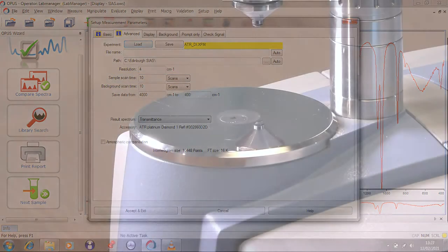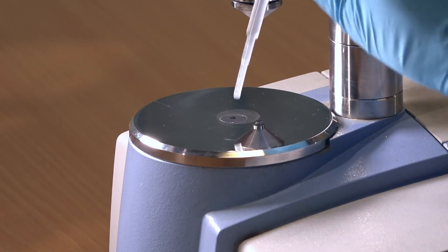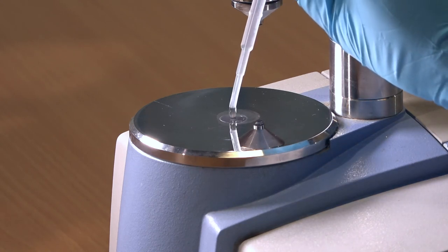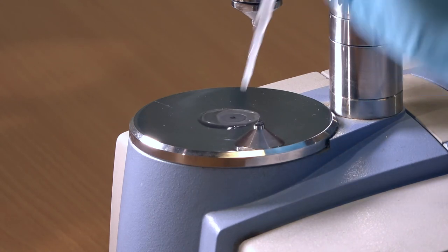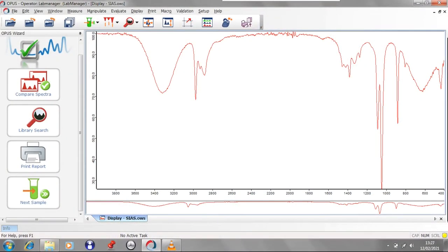Extra care must be taken with volatile samples as they may start evaporating during the sample measurement, which will result in a poor spectrum. To overcome this, you can reduce the number of scans, which will reduce the sample measurement time but will result in lower quality spectra. Or preferably, add more sample during the running of the measurement. This may need to be done continuously for very volatile samples or halfway through for less volatile samples.